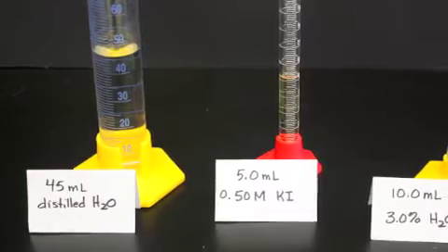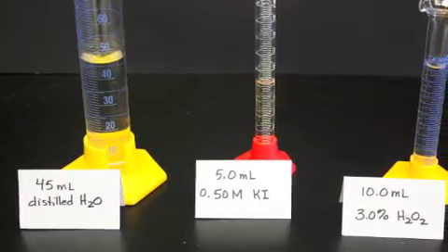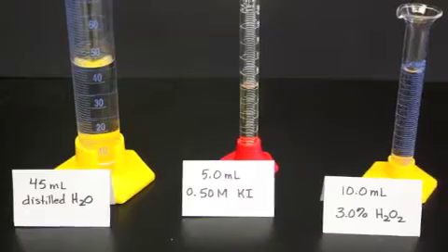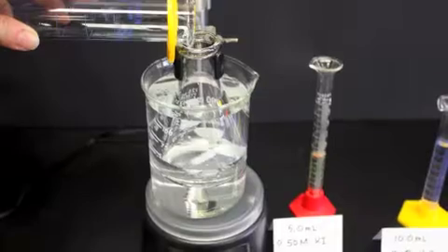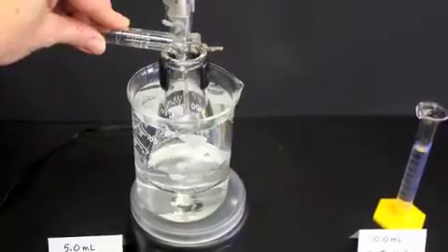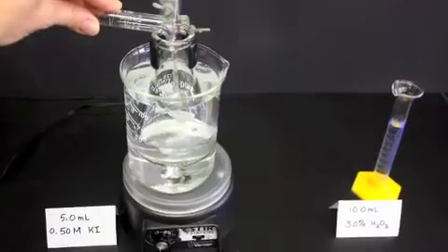Now you can measure out the reactants that you need for trial 1. You'll need 45 milliliters of distilled water, 5 milliliters of half molar potassium iodide, and 10 milliliters of 3% peroxide. I like putting these in 3 different size graduated cylinders so it's very easy to keep track of which reagent you're dealing with. Add your 45 milliliters of distilled water and your 5 milliliters of potassium iodide to the reaction flask. Reserve the peroxide for last.